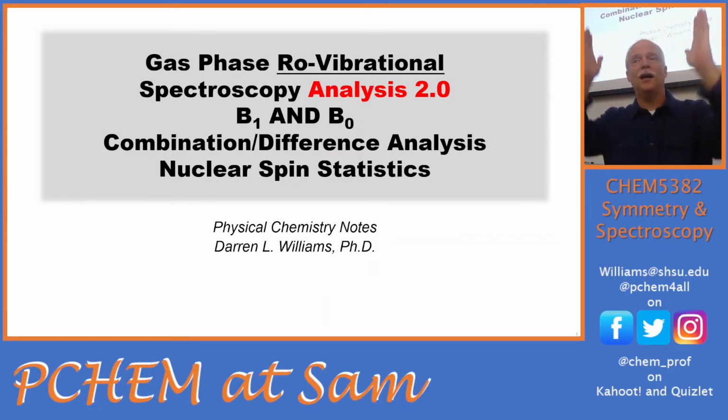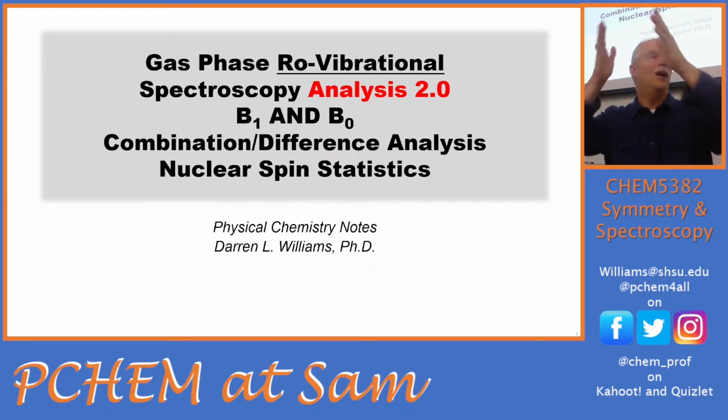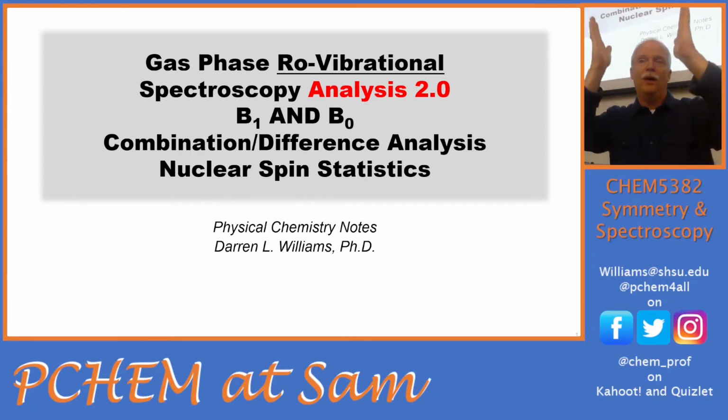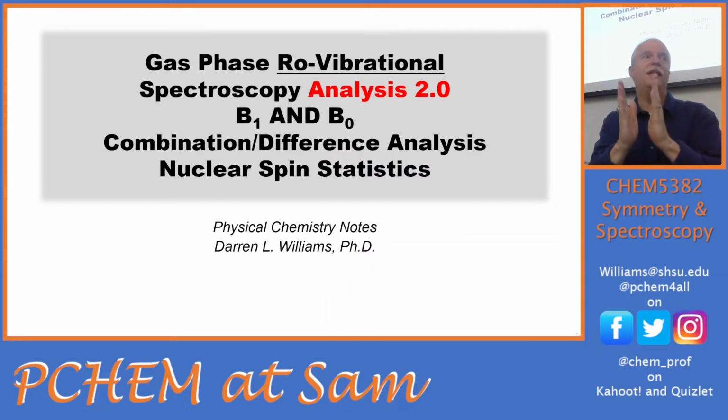If we have a true harmonic oscillator, all of these values would be the same because the bond length would be the same all the way up, no matter what the vibrational excitation. Even though we do have a real, anharmonic system, the HCl molecule, it's a pretty strong bond, and we're pretty deep in that well, so there's not a lot of difference in the bond lengths and the rotational constants, but it's measurable. It's very measurable, and we'll see how precise we are in those measurements today.